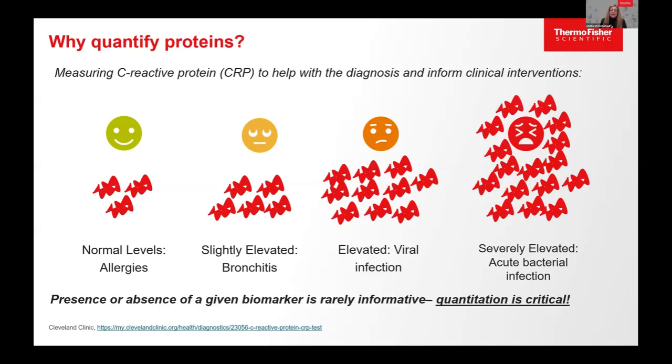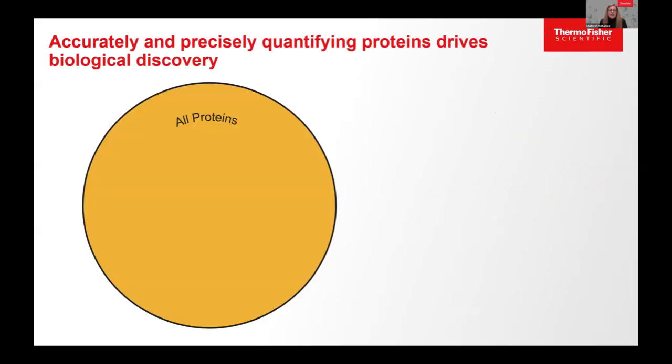The problem is that just to identify a protein is great, right? But to be able to quantify the protein, that is the value that you can take into clinical research or translational research. Because if you do any protein assay at the clinic, you see either an absolute value, a range, or a ratio. And with mass spec readout, you can actually do a discovery that gives you that kind of information to transfer to clinical research.